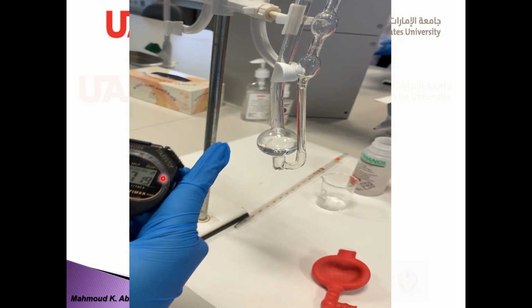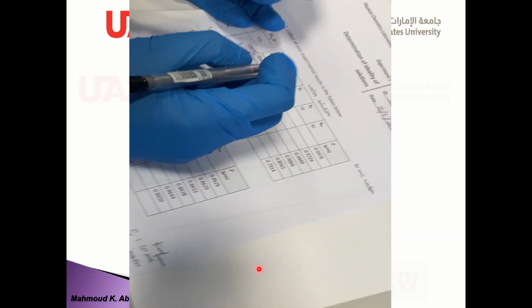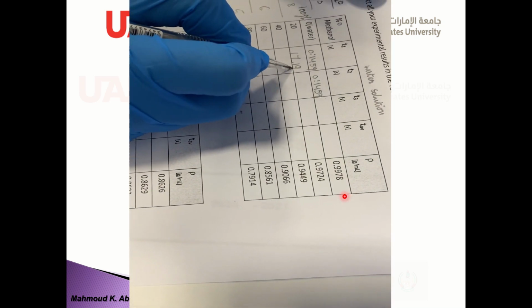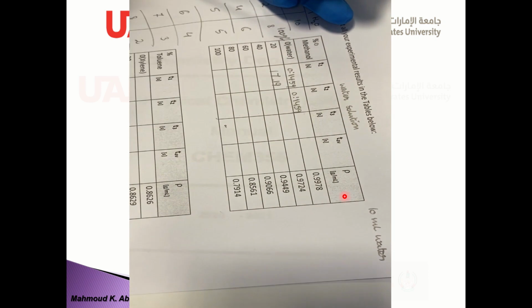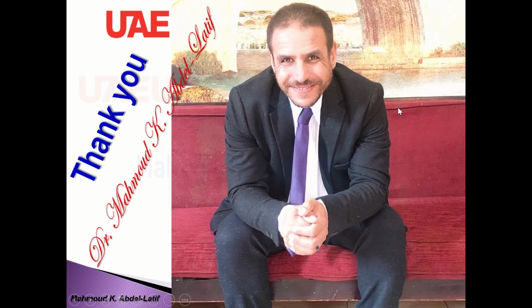It's 17 point. Just record the time so you can determine the viscosity, the eta, and then the fluidity, and then you can calculate the theoretical one and plot it against the mole fraction. This is the first experiment.